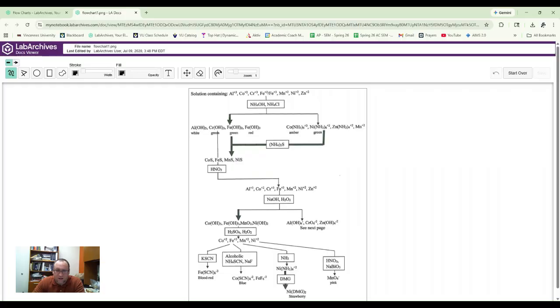And when we treat these solids with more peroxide and lower the pH using sulfuric acid, what we get are 4 ions that, interestingly enough, we do not have to separate from each other because there are characterization tests that exist that will isolate each of them through the use of some kind of chemical agent that will usually, in most cases, form complexes that have very distinct colors when put in the proper combinations.